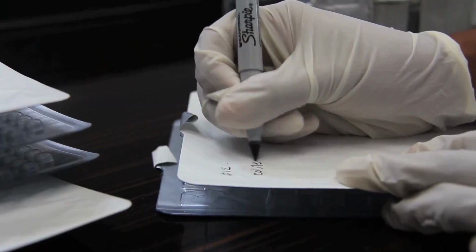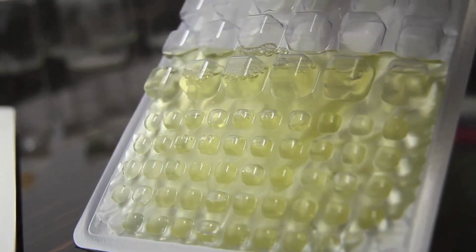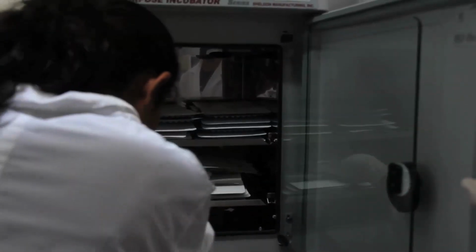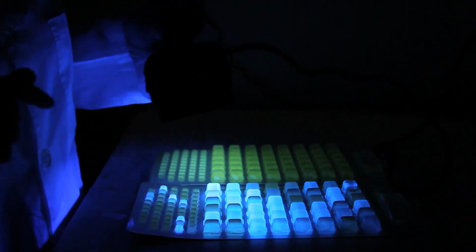Right now, I'm just labeling the Quanti-Trays for when we put the sample in them, seal them in the Quanti-Tray sealer, and then put them in the incubator. Right now, we're looking at the wells that light up with the UV light. This means that there is presence of Enterococcus or fecal coliforms within the water sample that it was taken from.